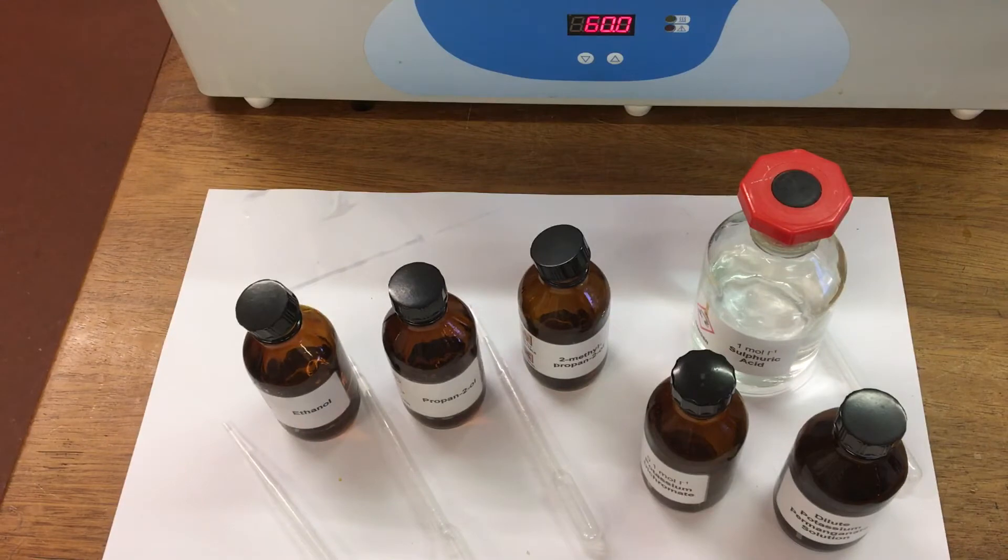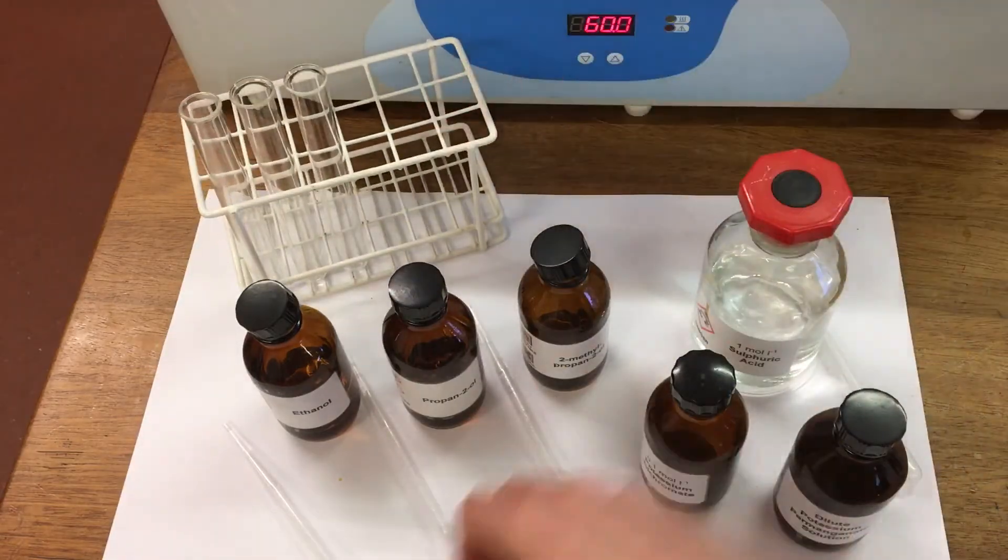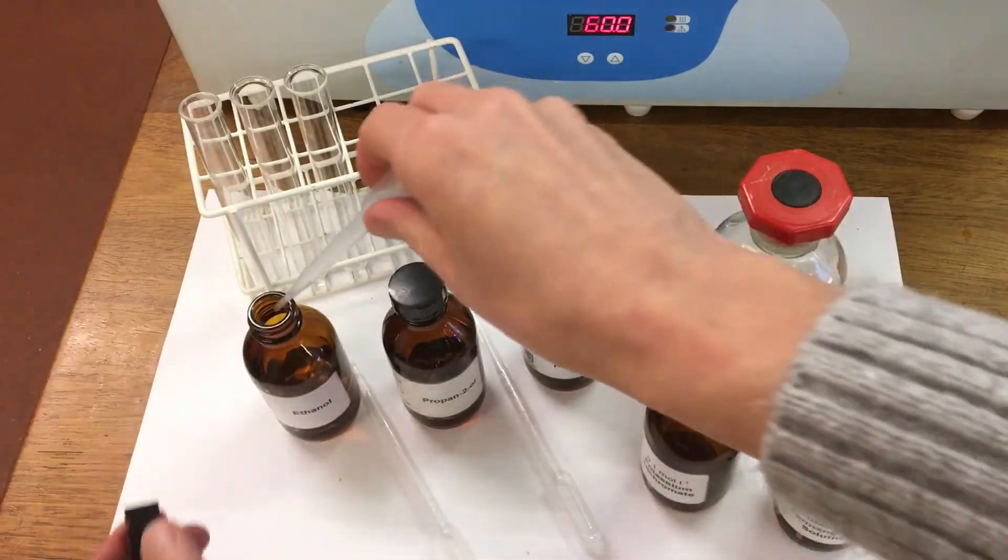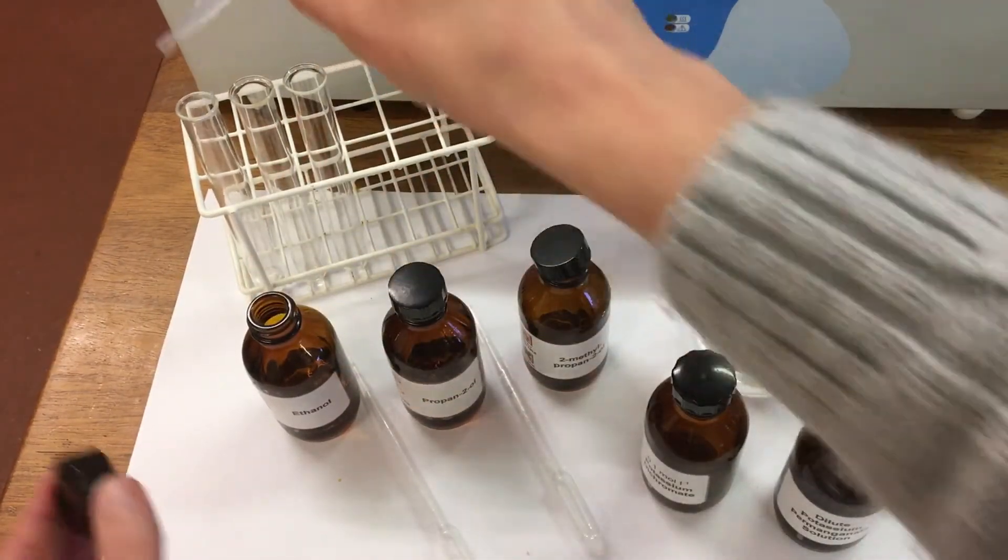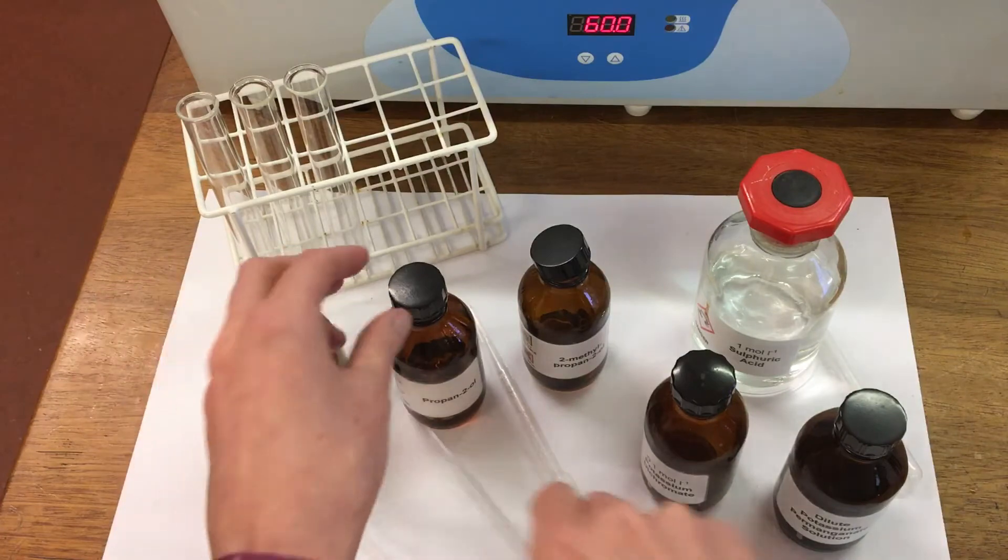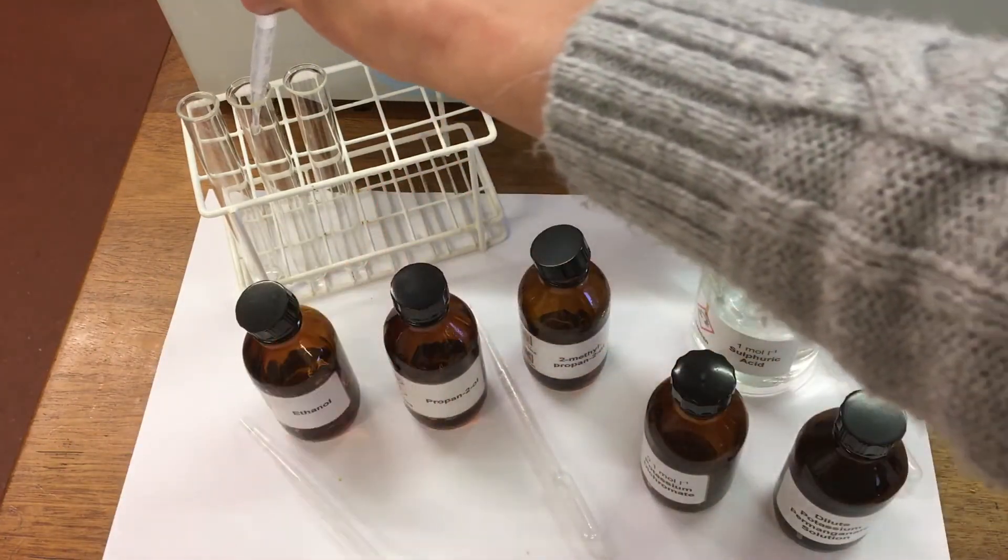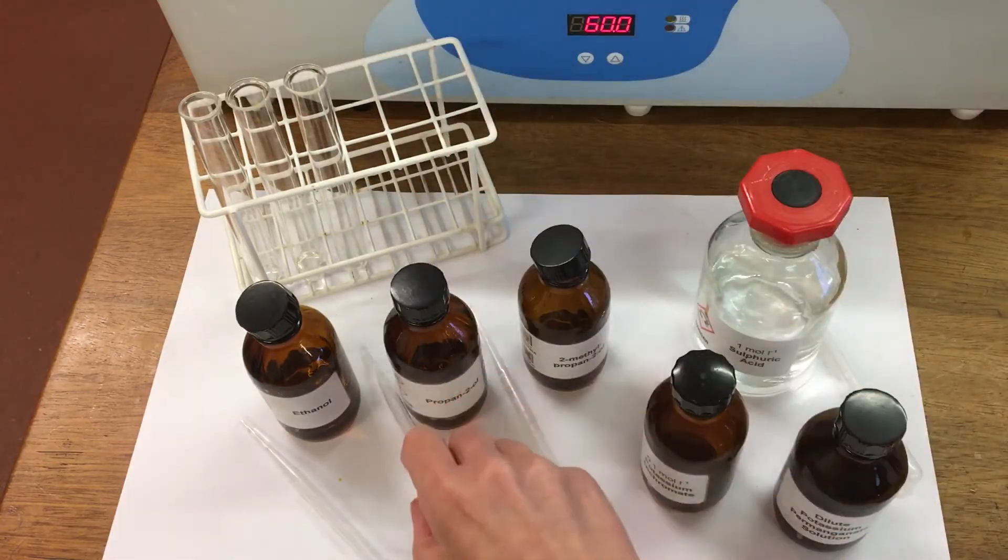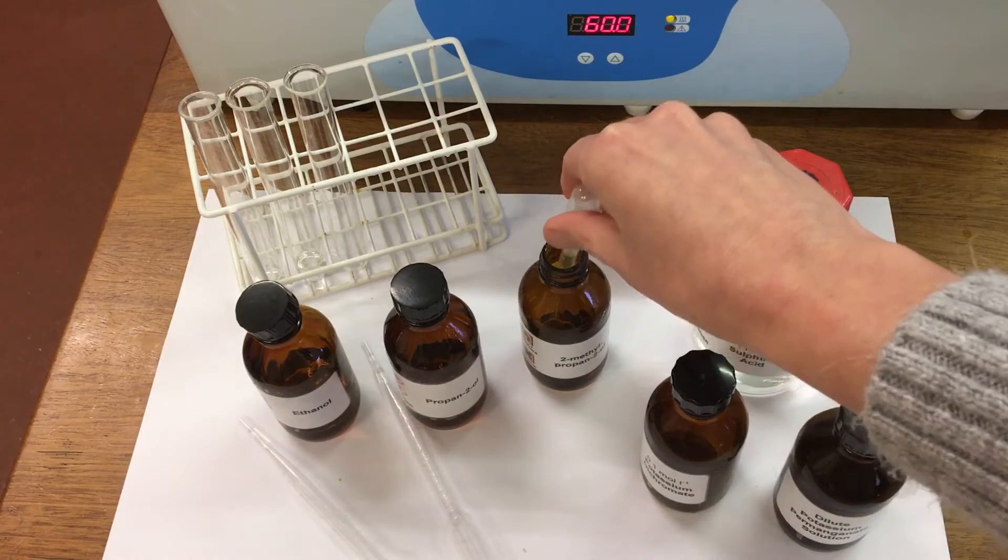And then I'm going to repeat the experiment with our second oxidizing agent. So we're going to do exactly the same. Again, we're going to pop some ethanol into our test tube, propan-2-ol, and then the 2-methylpropan-2-ol.